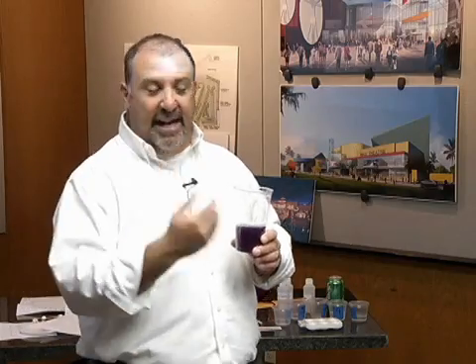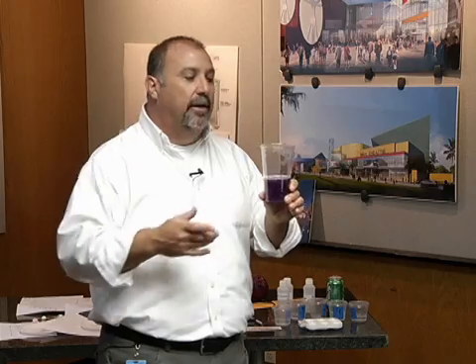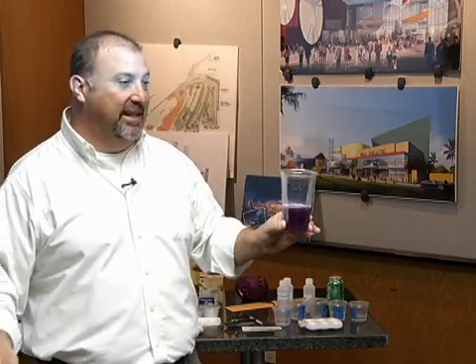If it stays violet, it's going to be neutral, kind of like how it is in here. If it goes blue or green, or bluish green, it's going to be a base. With this, it's not going to give us an exact number, but as a general guideline, the stronger the color change, the more acidic or the more basic it's going to be.